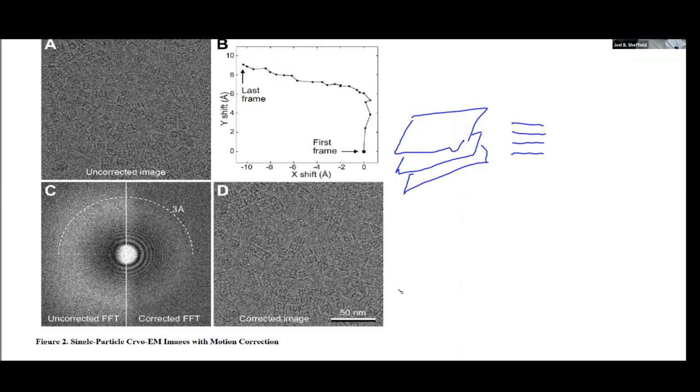Well, it turns out that the way the analysis is done of these images is you take this Fourier transform and you go through essentially the reverse of the math that generated the transform. But now what you've done is you've modified that transform to enhance certain features of it, so that what you end up with is an enhanced image of your sample.